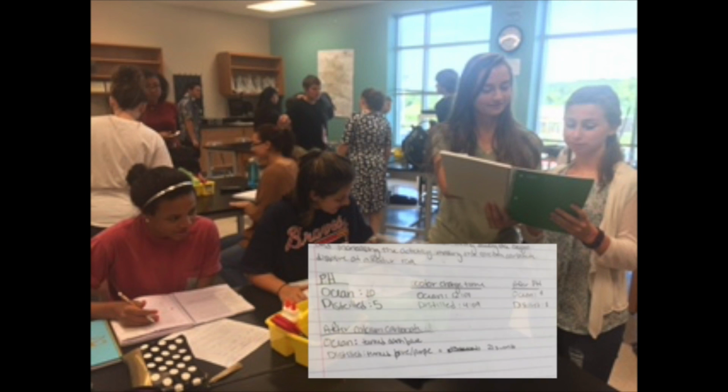For the second group, the original pH of the distilled water was 5, and after they added their carbon dioxide, the pH went down to 1. It took 4.04 seconds for it to change colors. We both found that the original pH of the distilled water was 5 and became more acidic after adding in the carbon dioxide. Ours took almost 2 seconds longer to change colors. The original pH of the ocean water was 10, and after adding in their carbon dioxide, it went down to 4. It took 12.01 seconds for their ocean water to change. So with this, we both found it took about 12 seconds for the color to change and it to have a significant drop in the pH.